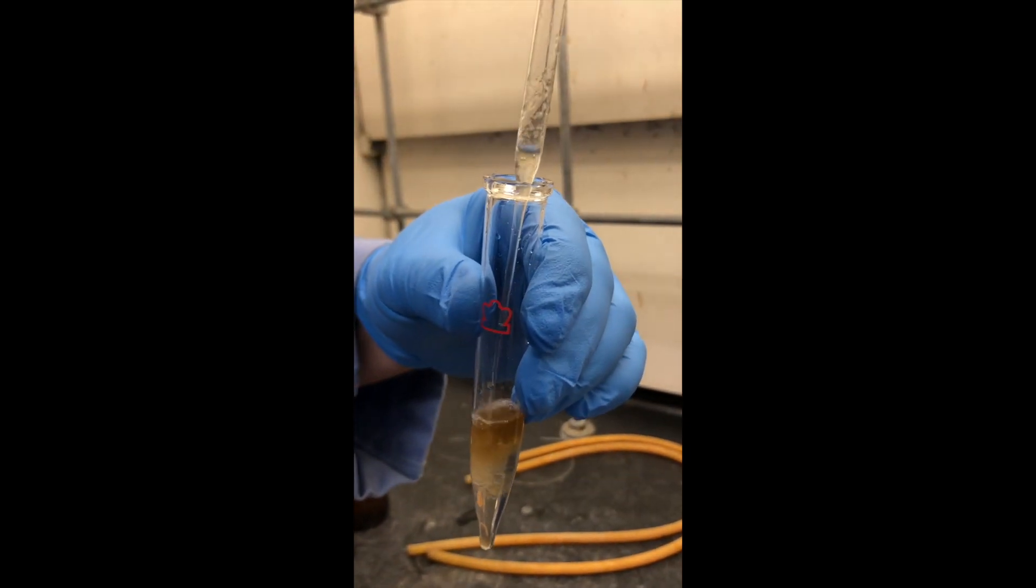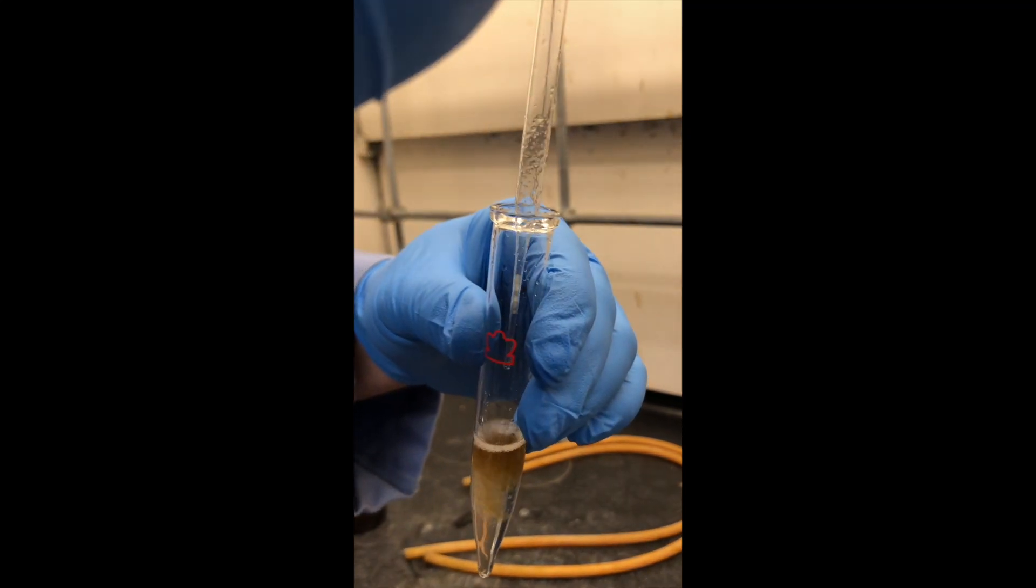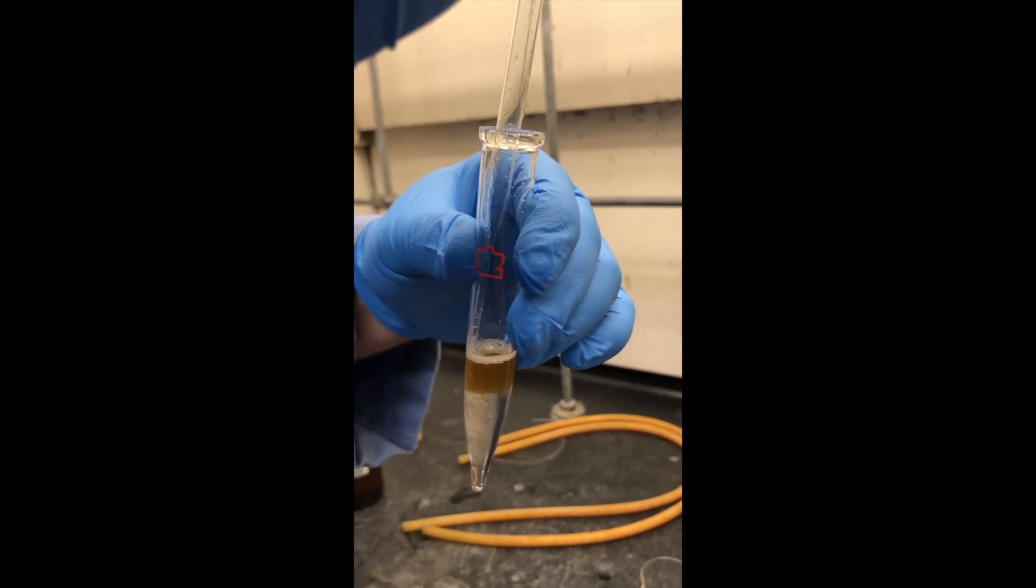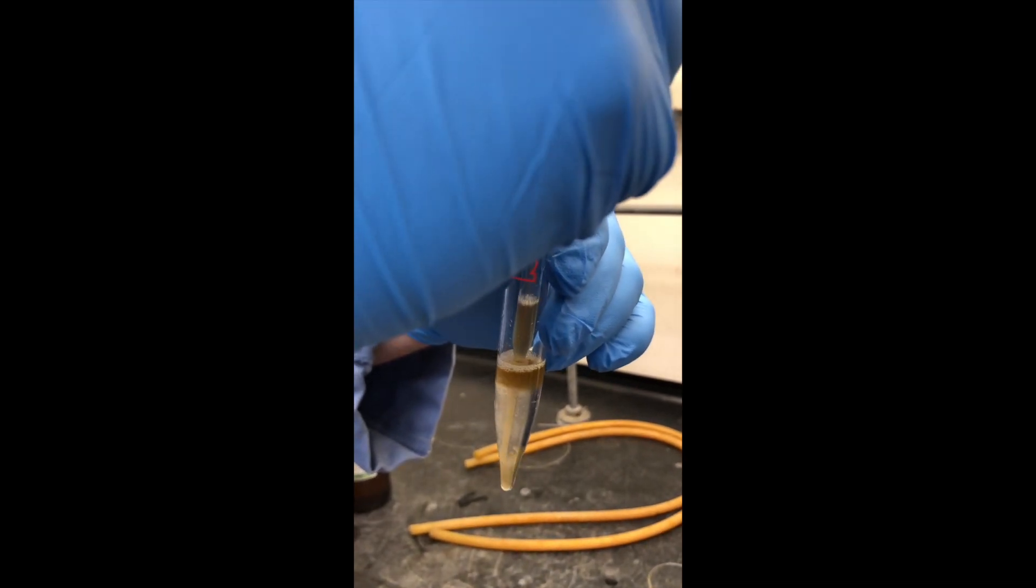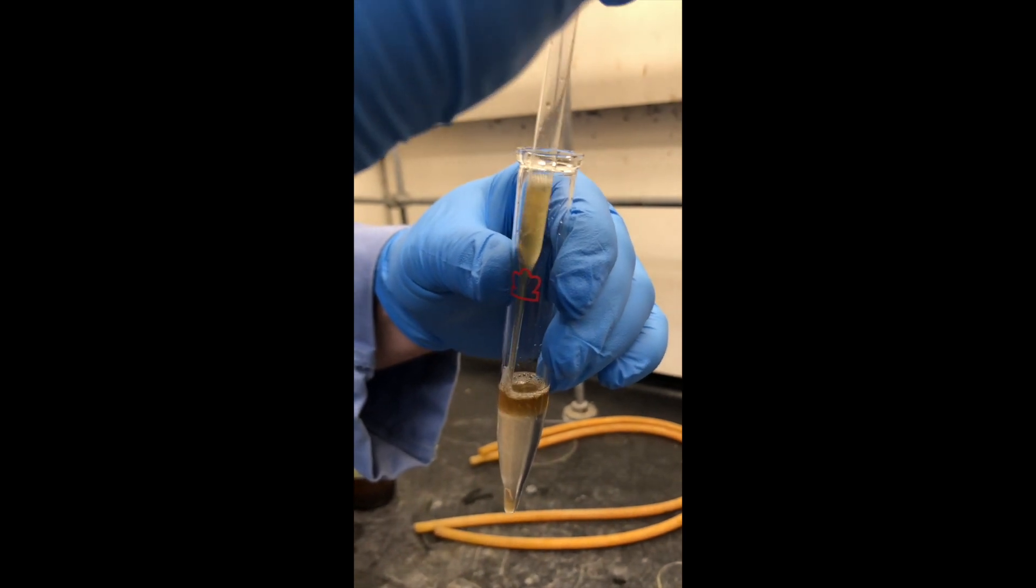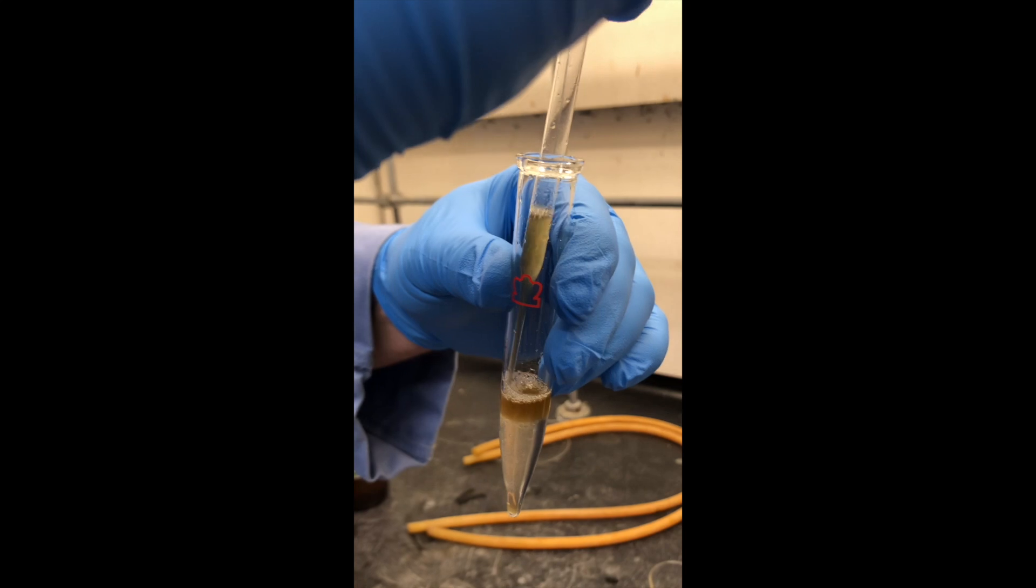So you can draw up the lower layer, drop it into the upper layer and do that a few times. Then you can draw the upper layer and expel it into the lower layer a few times. Luckily it's not making an emulsion. With E30 it doesn't make that much.